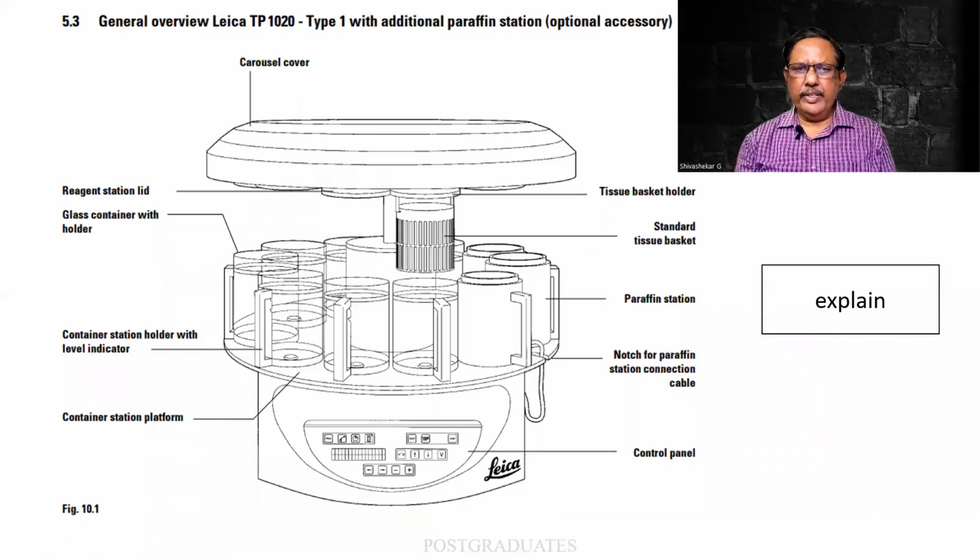So again, a repetition of the same. So let me see this. I find that there is an umbrella over here which covers the entire thing. Also, there will be a lid that is available. This will be preventing the evaporation of the fluid. Most of them will evaporate. Take it to be alcohol or xylene or whatsoever. They have got a tendency to evaporate. And in order to prevent it, there will be a lid that snugly fits. I won't say tightly fits.